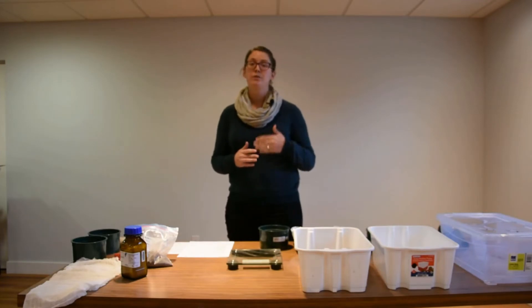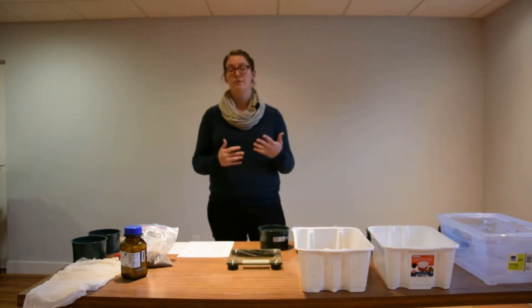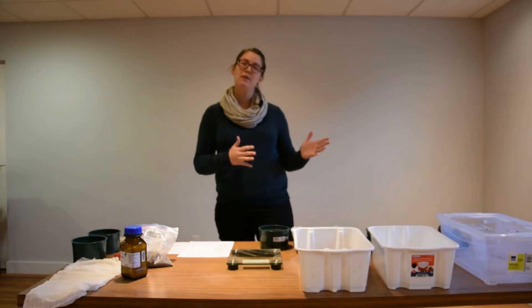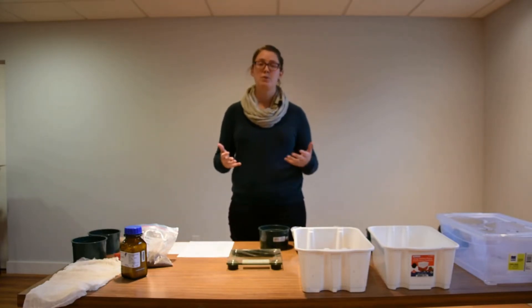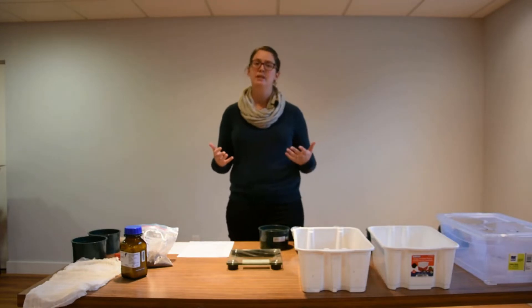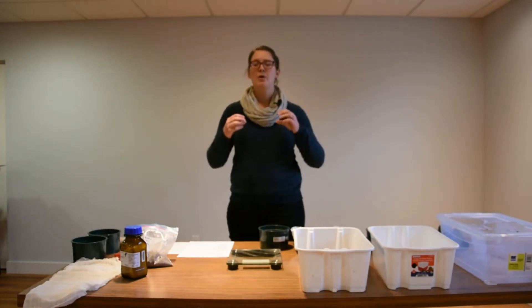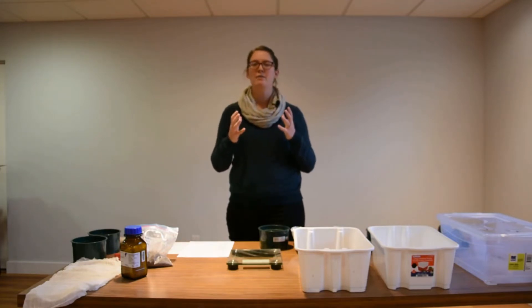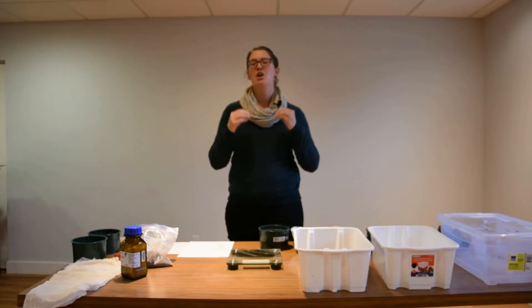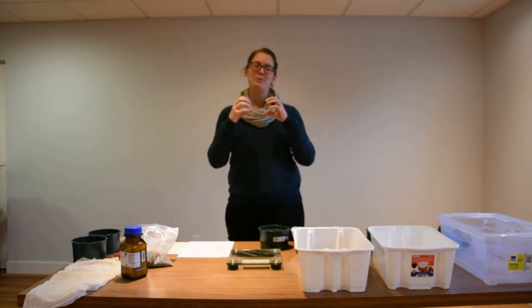We're here today to continue your work for your soil science project for 4-H. You've gone out to the field, you've collected some of your soil samples, and now I'm going to go through the process of testing your aggregate stability. Aggregates are particles of soil that are bound together — they look like little clumps in the soil. You can think of them as cottage cheese. This test is going to measure how strong those particles of soil are holding together.